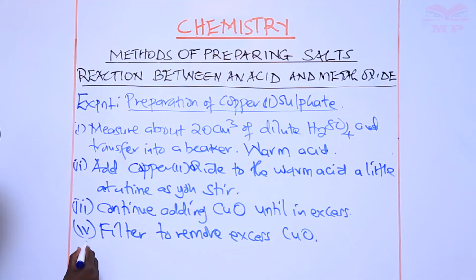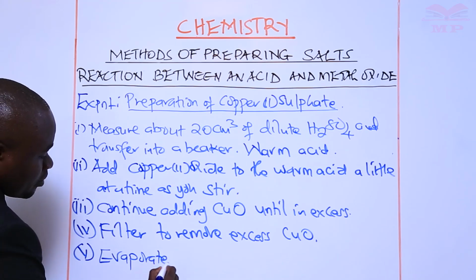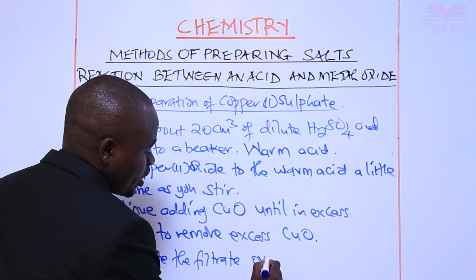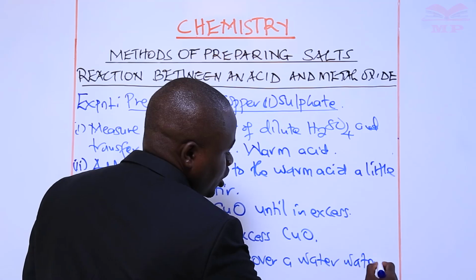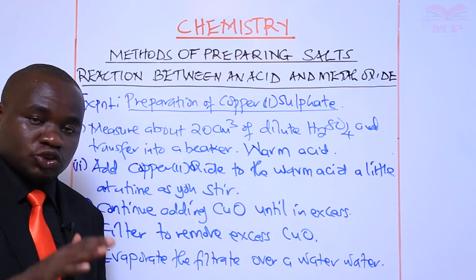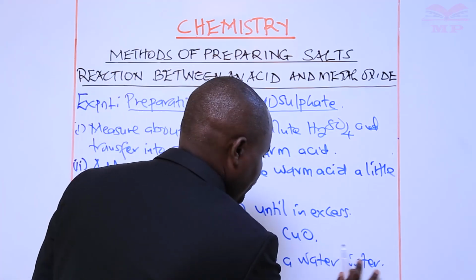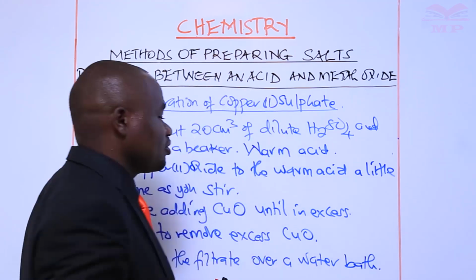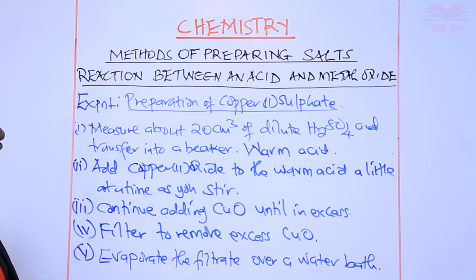So lastly, after filtering, you evaporate the filtrate over a water bath. We are using a water bath to simply slow down the process of evaporation, and that will help us in obtaining large crystals.